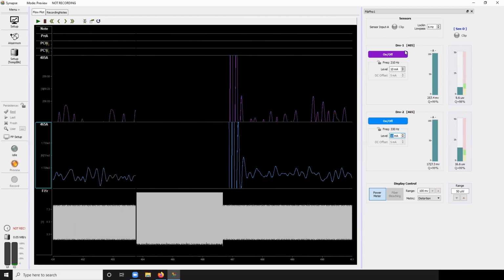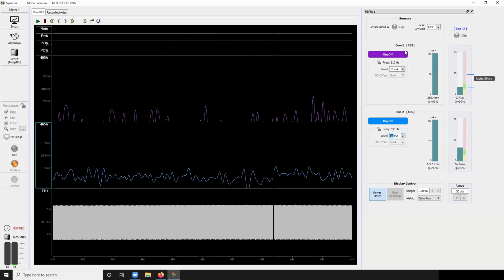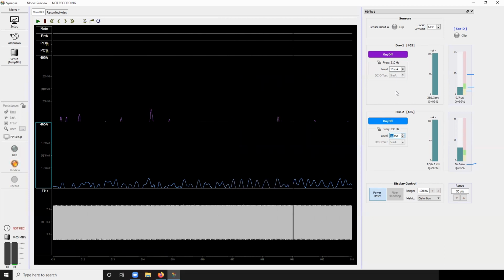All right, so looking at the right side bar, what do we see? We have this yellow, green, red. Remember that power target range of 10 microwatts I talked about earlier? That's what this green thing is. It doesn't mean anything. It's arbitrary. All that you care about really is this number that you're seeing here. So for photometry, it really depends on what you're using, but typically I recommend 10 to 30 microwatts is a good starting point for most things. D-Light, maybe a little bit on the higher end, 30 is good.